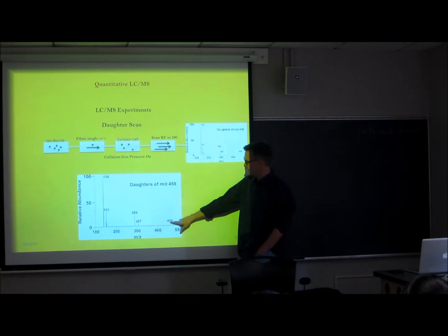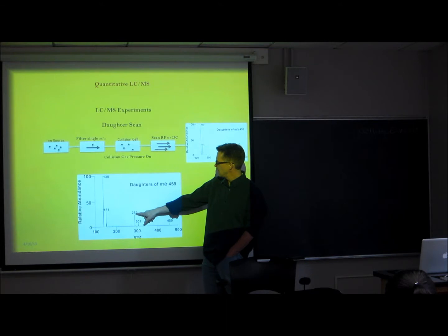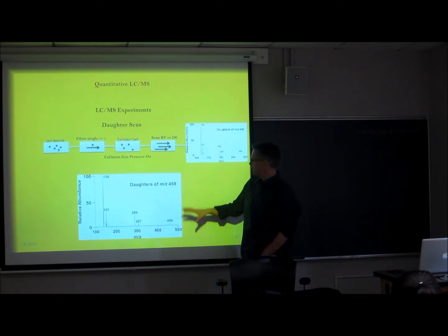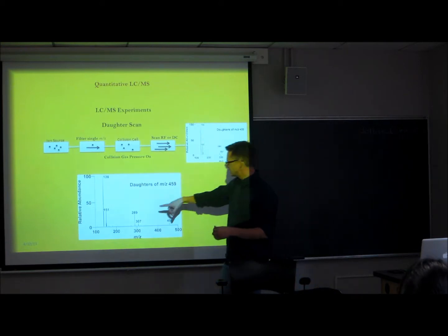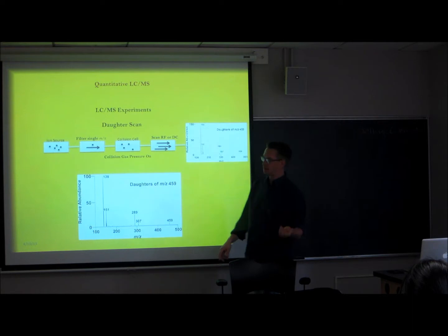Here's our precursor ion 459 that we filtered through the first quadrupole and broke into pieces. You lose gallic acid from the 459, you get a 307. You lose another water or hydroxyl off of that, minus 18 Daltons, and you get your 289. And then the ion actually goes through, I won't show it, a retro-Diels-Alder gas phase chemistry that breaks down, and you get this very characteristic ion of polyphenols and catechins at 139.